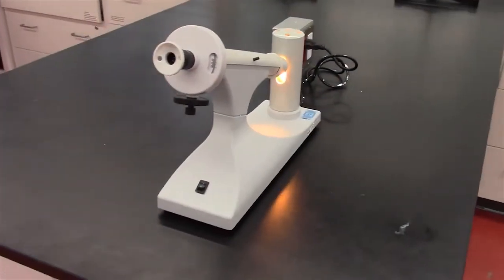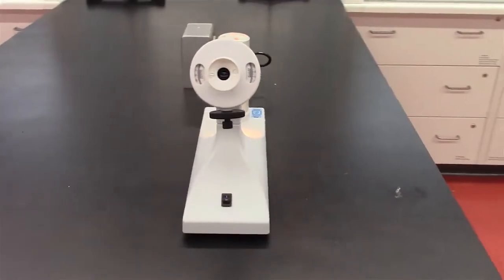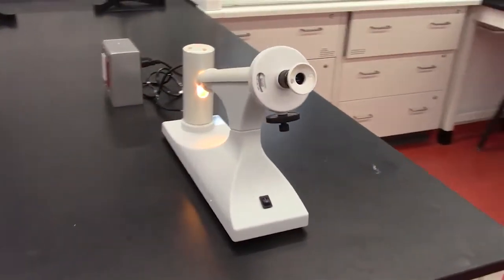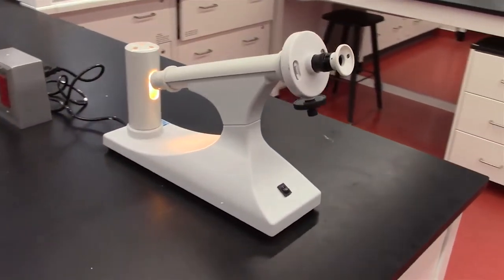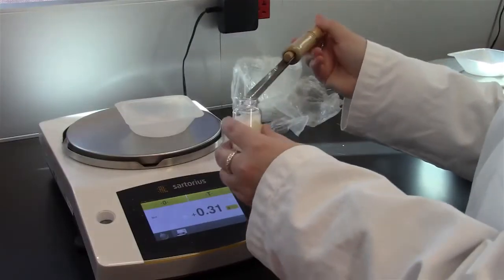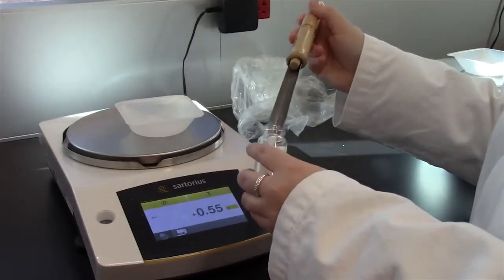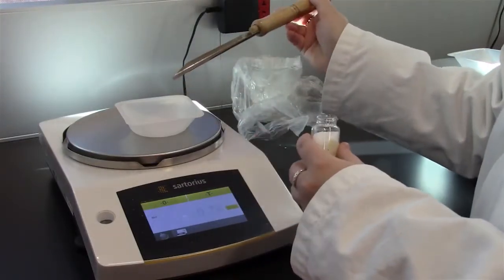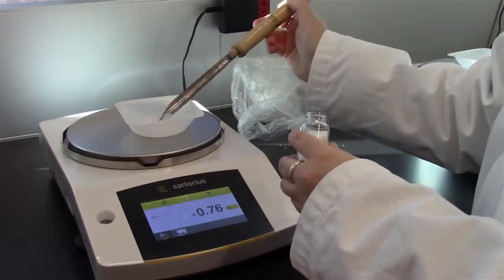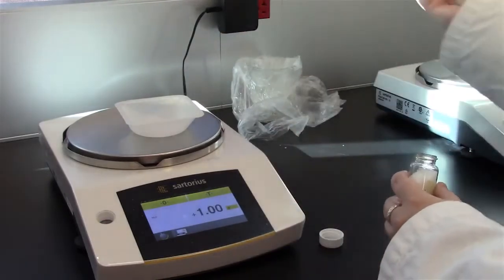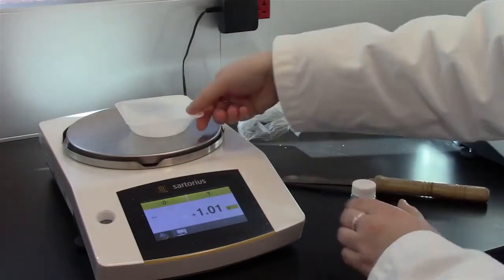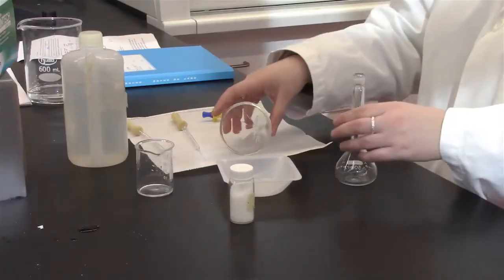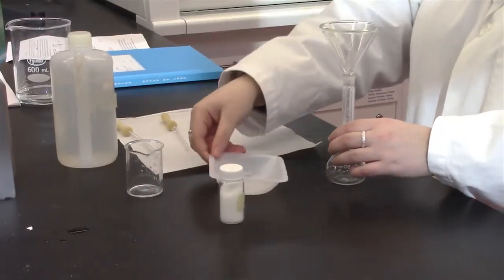The polarimeter machine will be turned on by your TA prior to the beginning of the lab. Prepare your solution with your unknown substance and note its concentration. To prepare the solution using your unknown substance, weigh out the desired mass of substance and using a funnel, transfer it to a volumetric flask.